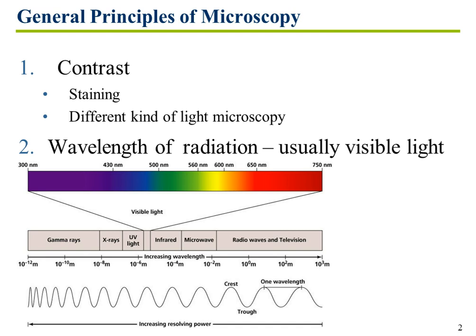The other thing you can do is change the type of microscopy that you're using. You're all familiar with what is called bright field microscopy. Your objects are darker or they're stained against a white background. We, of course, use that most of the time in this course. But we have dark field and phase contrast that we can use, and those types of microscopy very often not only look much more interesting, but they highlight an object in a way that bright field microscopy does not. So the two ways to increase contrast of clear small objects: staining and change the type of microscopy you're using.